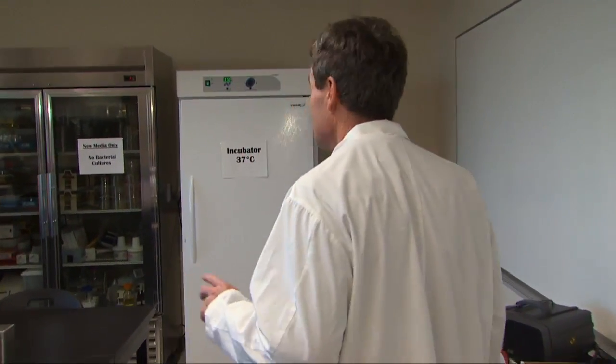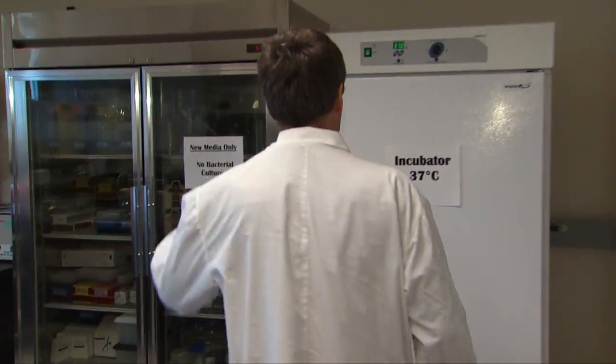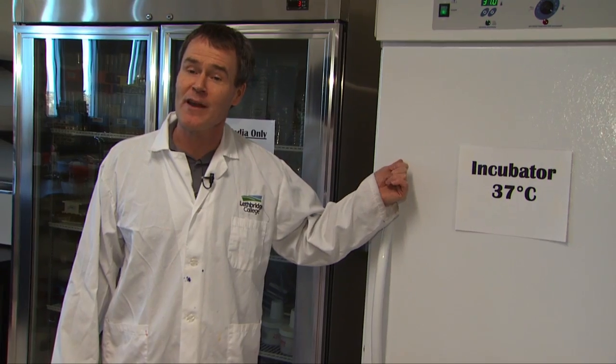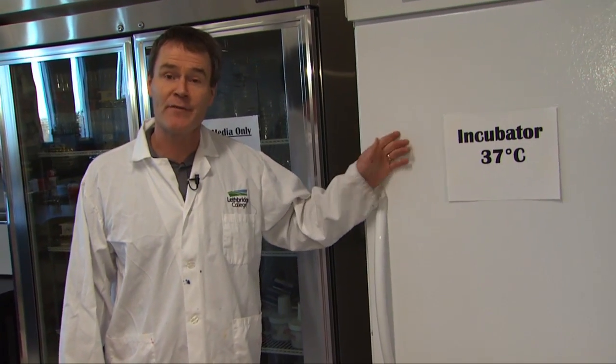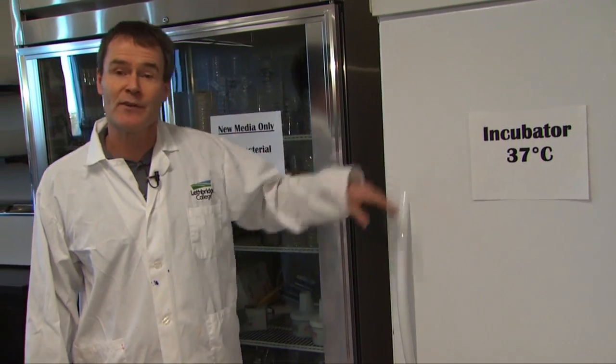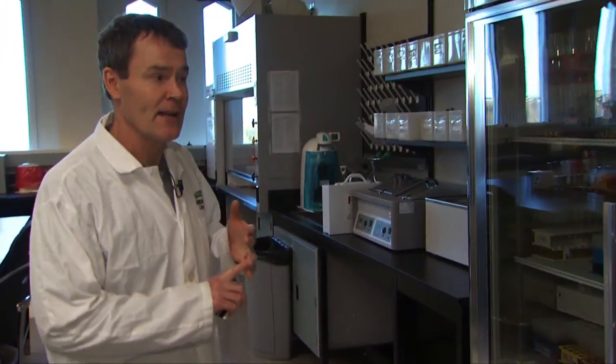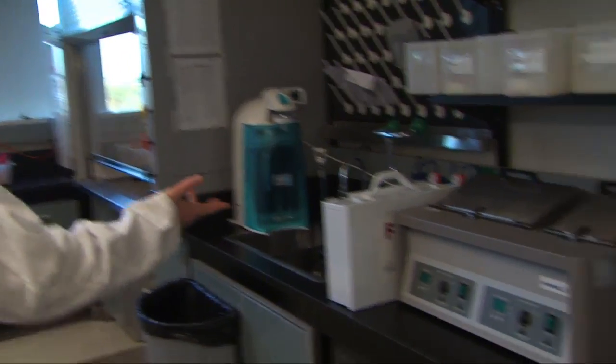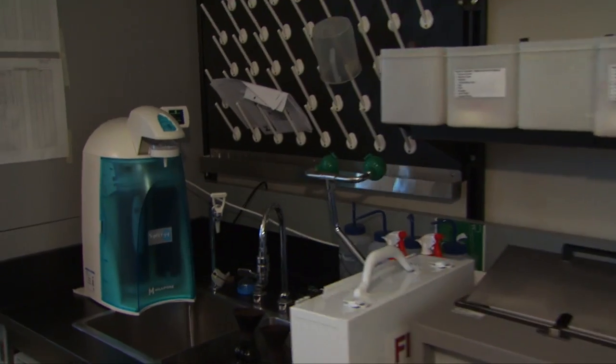If we go through we can look at some of the facilities. This is a full-fledged incubator. It's set at 37 degrees Celsius because that's the body temperature. A lot of this is related to human infectious diseases and so we'll do a lot of testing looking for different bugs like E. coli, Salmonella, Staphylococcus and some Streptococcus.